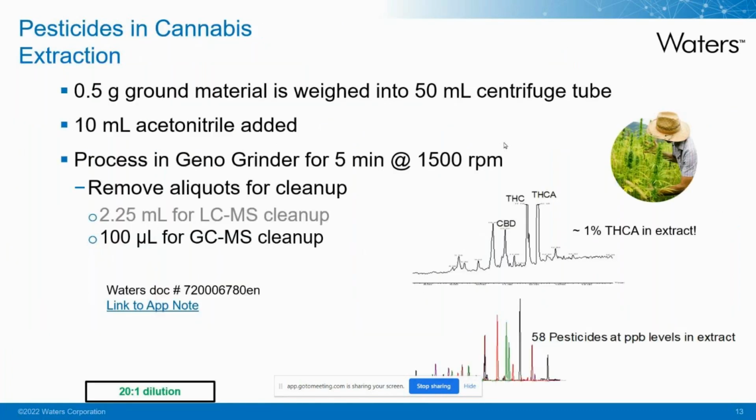So if we go on now to looking at a specific example of the use of this technique, this is a good match for explaining why people are bothering more and more with tandem quadrupole in both LC and GC-MS studies on environmental and food matrix samples. There's a tendency to want to do broader characterization and look at a wide range of chemical compounds. As we know, pesticides can be neutral, acidic, basic, and span a broad range of chemical classes. Pesticide, of course, is its intended use as opposed to its chemistry.